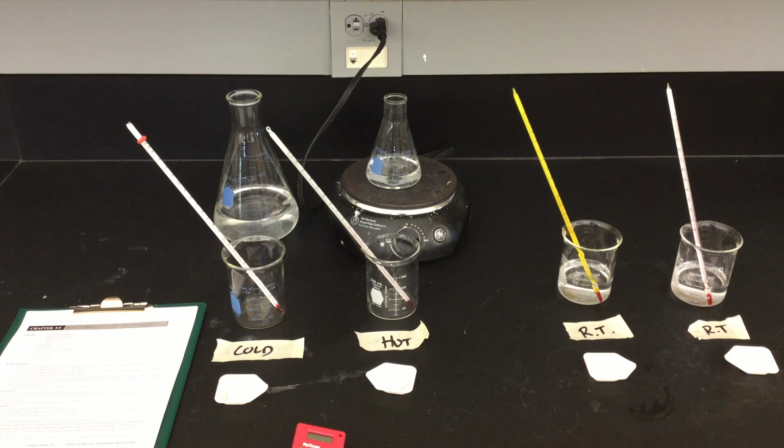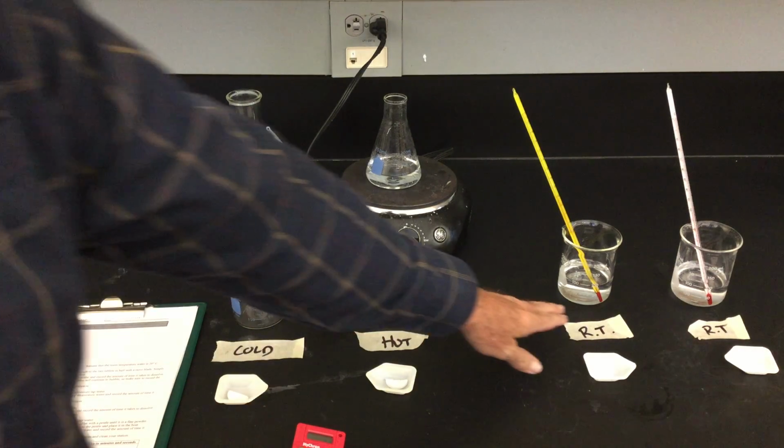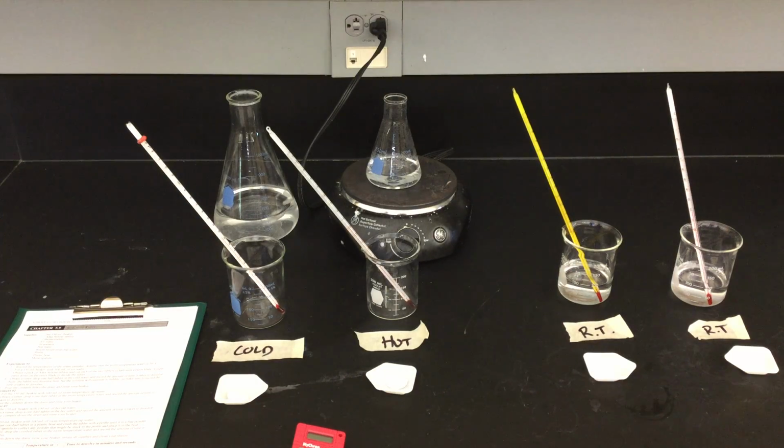Okay, we're going to be doing the reaction rates lab, the chapter 5.9 lab, and we just had a lecture on reaction rates. What we're going to be looking at is temperature. So we're going to have cold water in here, hot water in here, room temperature water here, and the very last one is going to be a comparison of two room temperatures.